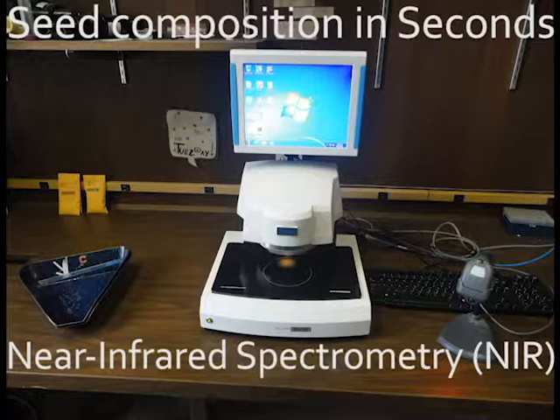A near-infrared instrument can be used to determine the seed composition of a large number of samples quickly. Samples are read by the machine in a matter of seconds. The machine uses calibrations that were developed using hundreds of samples with known composition. This video will demonstrate how NIR works to read seed composition of both whole soybeans and ground soybean.